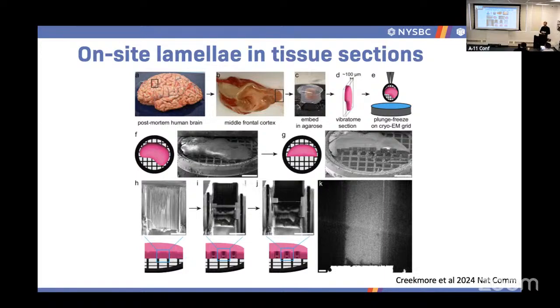Somebody last year came out with a different approach. I thought, how about we take a tissue that can quite nicely self-cryopreserve, and that's brain. Pretty much, that's the only one that I know of. Brain and yeast, because there's a lot of fat and a lot of sugar, and this basically acts as a cryoprotectant.